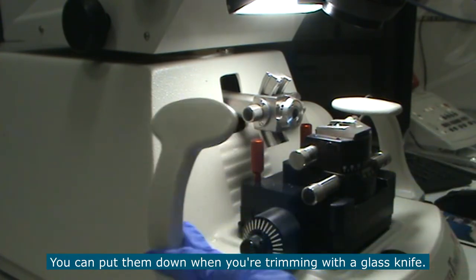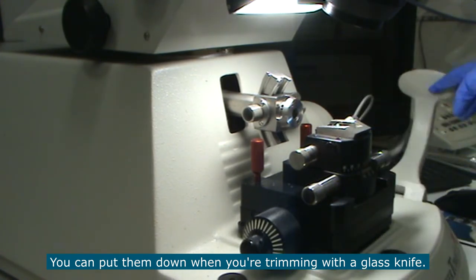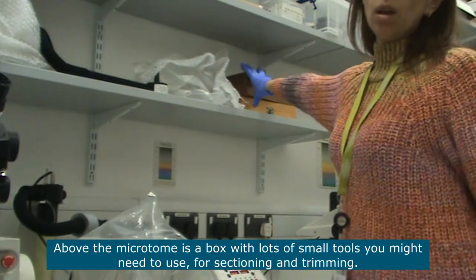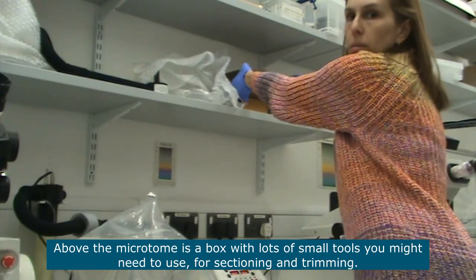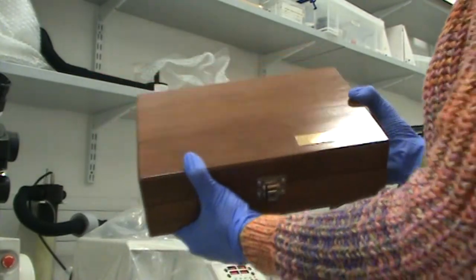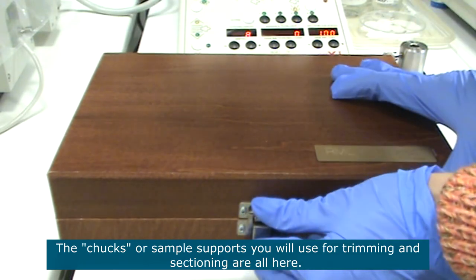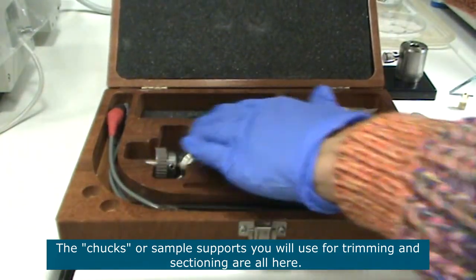These two pieces here are arm rests that you can use for trimming by hand with a razor blade. You can put these arm rests down when you're trimming with a glass knife. Above the microtome you will find a box with lots of small bits that you might need to use when you're sectioning and trimming.